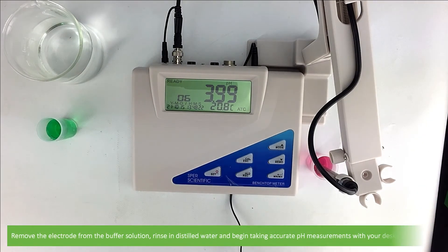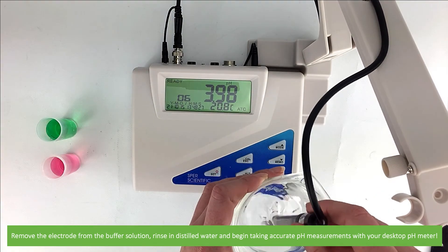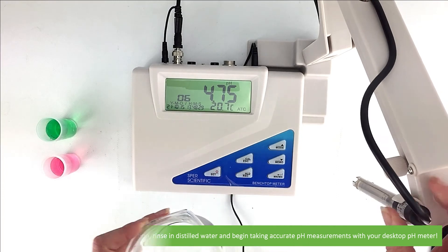Remove the electrode from the buffer solution. Rinse in distilled water and you can now begin to take accurate pH measurements with your desktop pH meter.